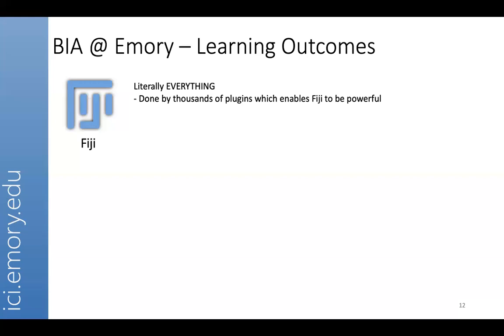So think about Fiji as one of those coffee makers in which you put in a pod, right? If you want to drink a coffee with, let's say, a nutmeg flavor, which is a very terrible flavor as a matter of fact, but if you wish to drink something like that, what you do is you get this coffee pod, you put that into the coffee machine, and boom, you get a coffee, right?